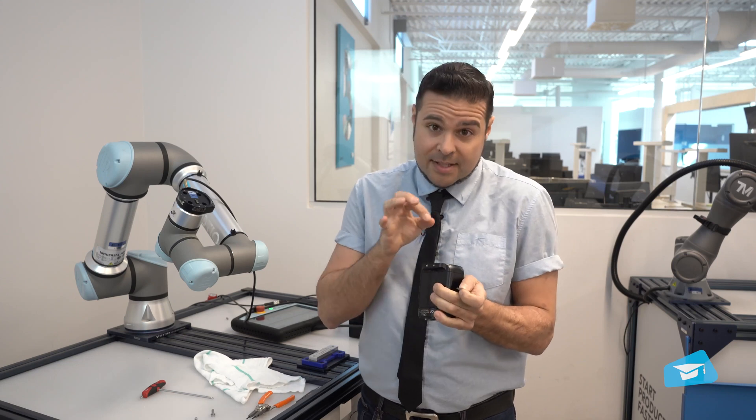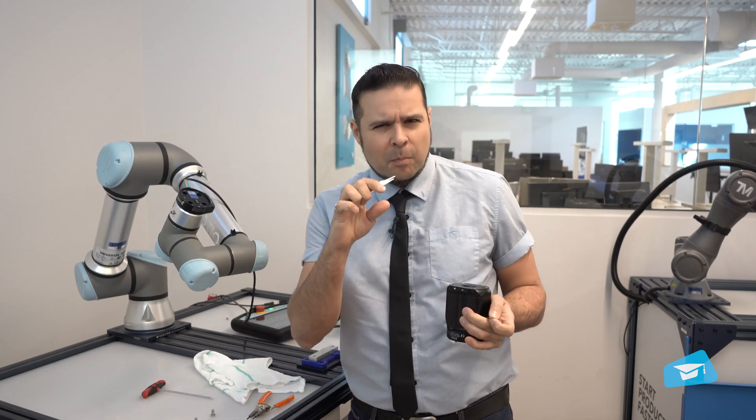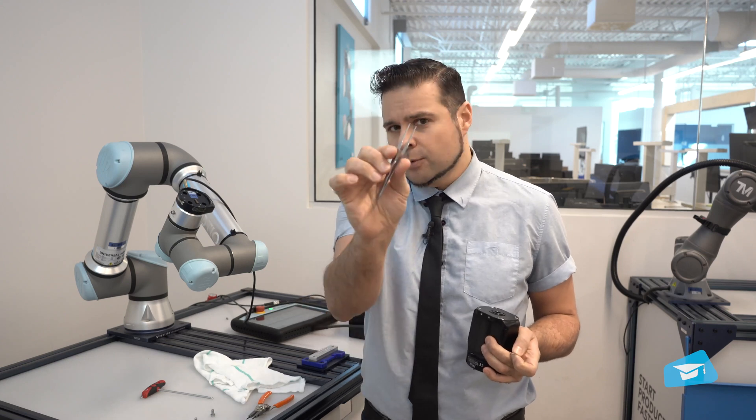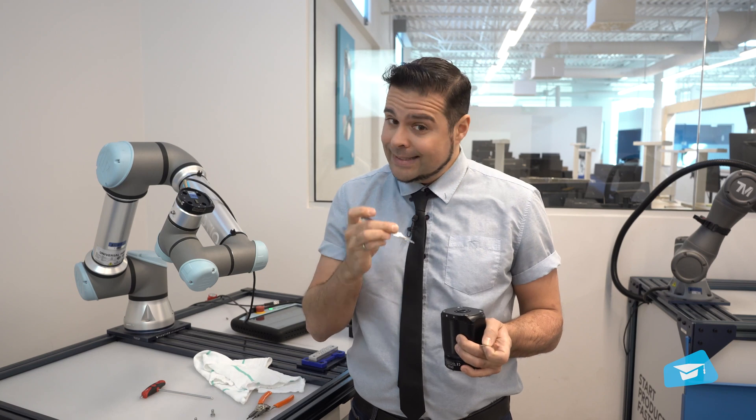If you're not as lucky, it might be stuck down there. You'll want to take a pair of very small pliers like long nose, or tweezers, and go and get it — but be careful because you might damage it. So before doing this, make sure you have a brand new one on hand.